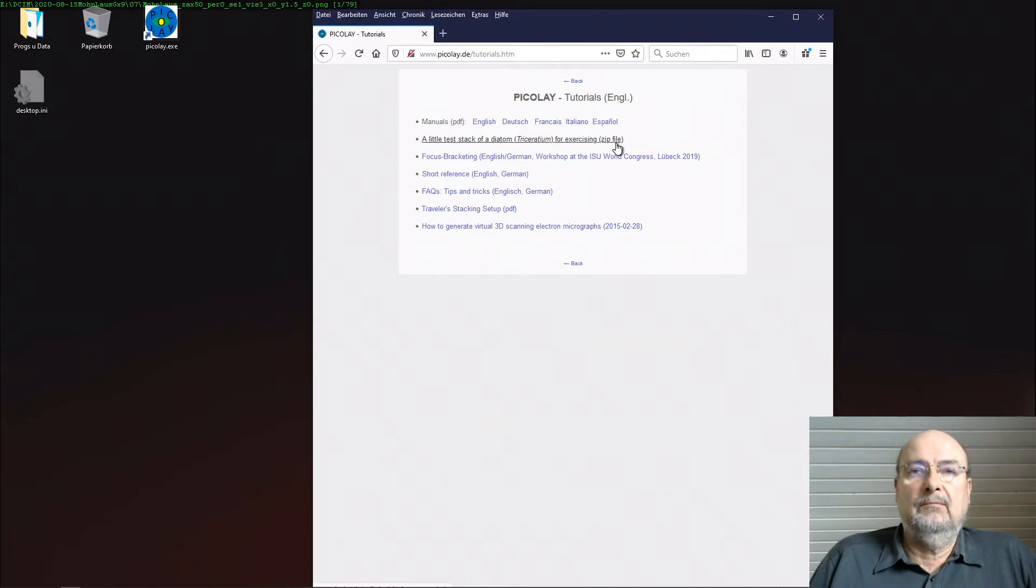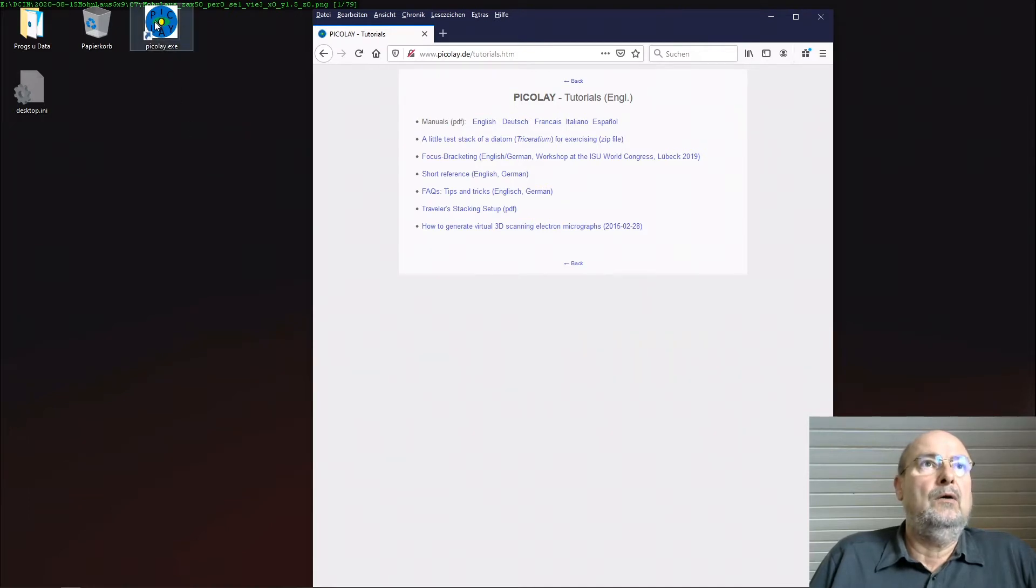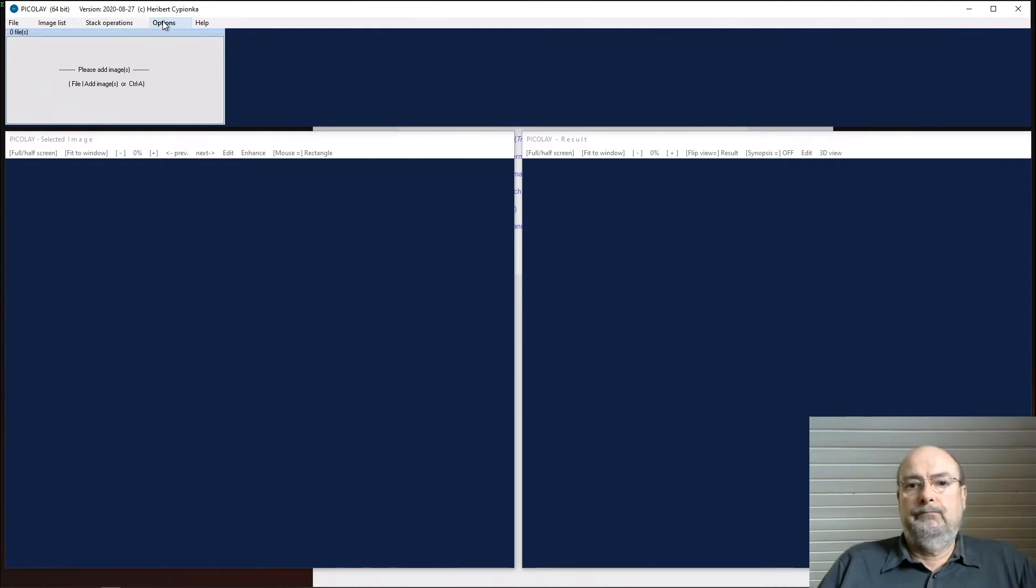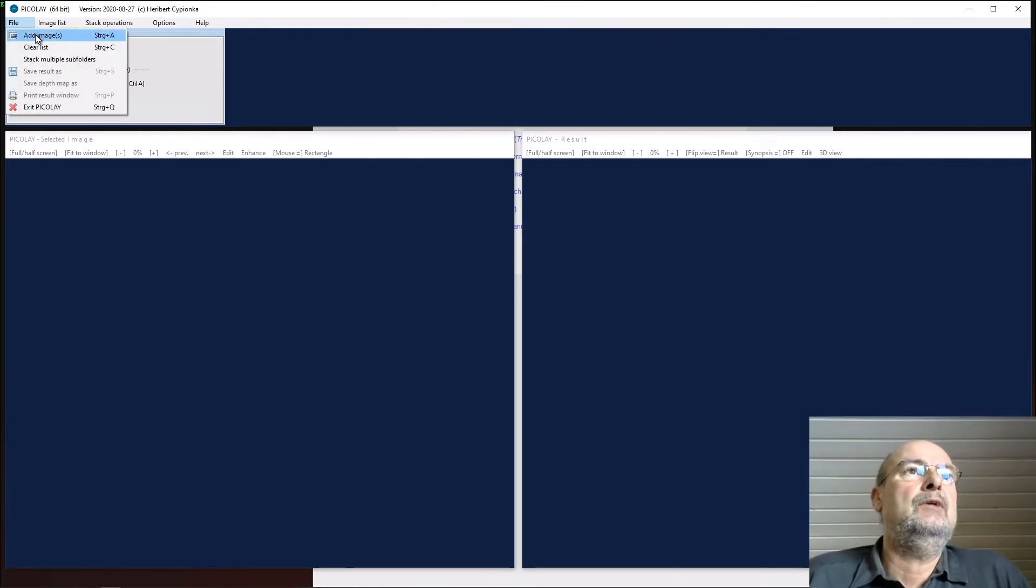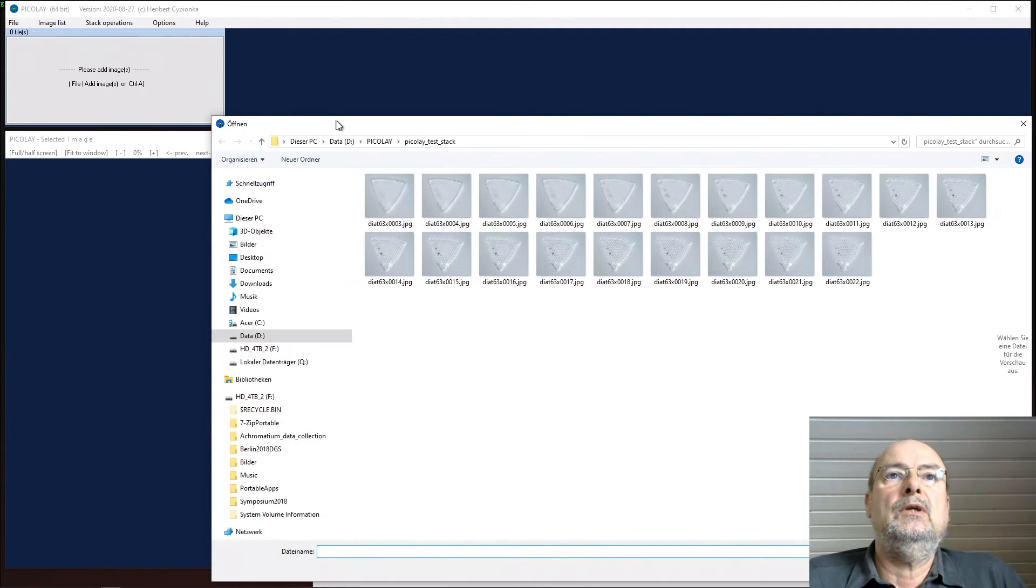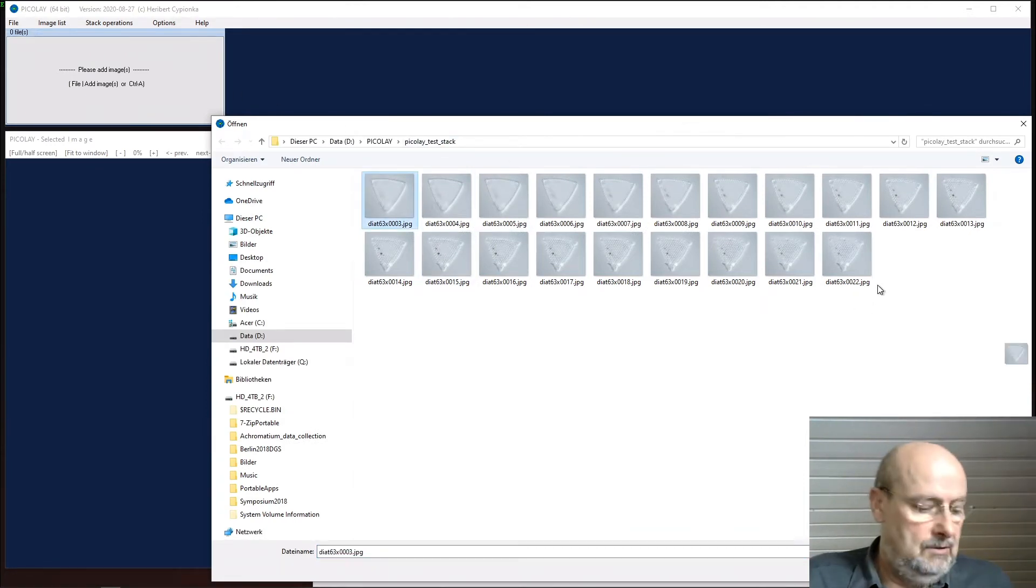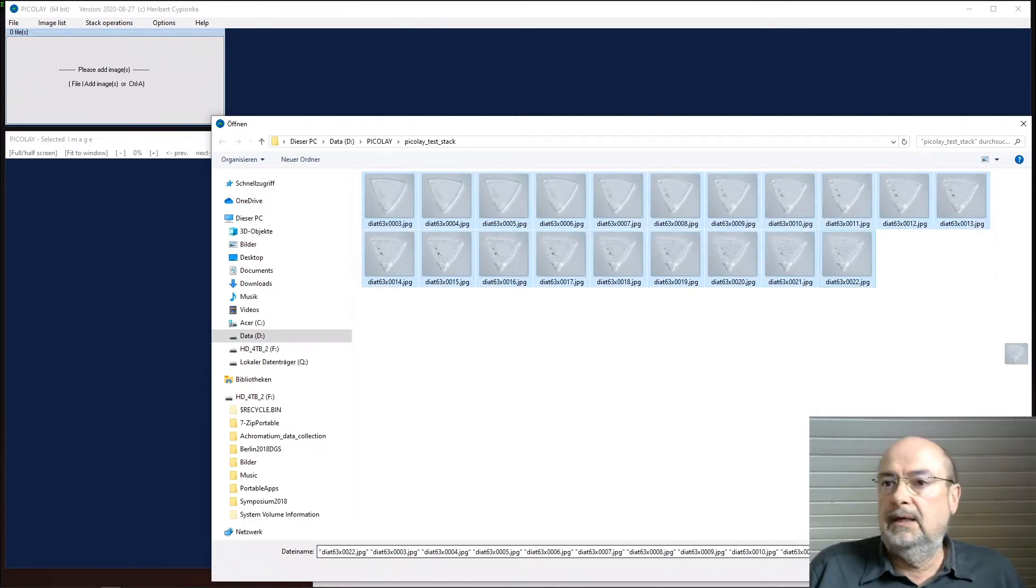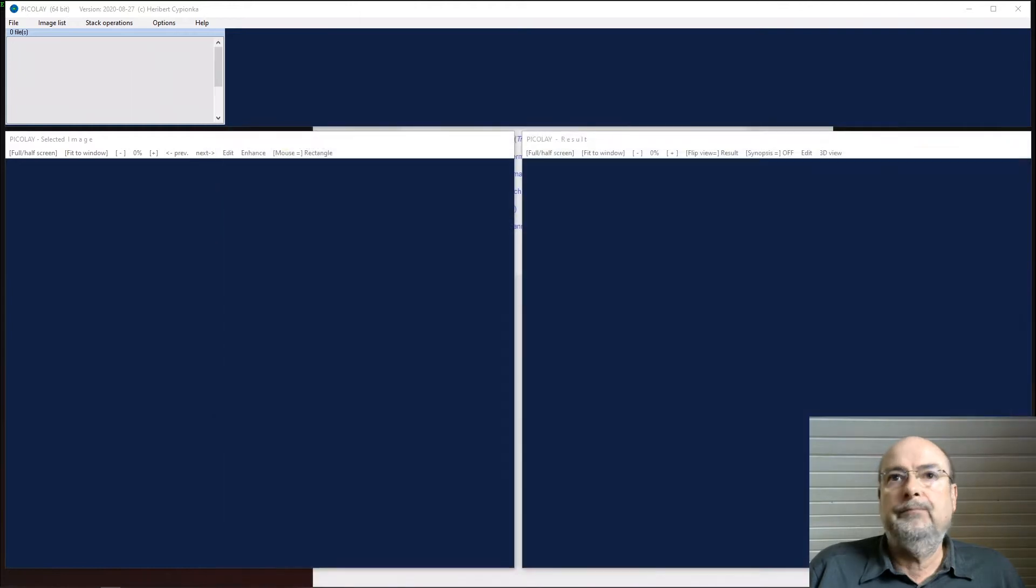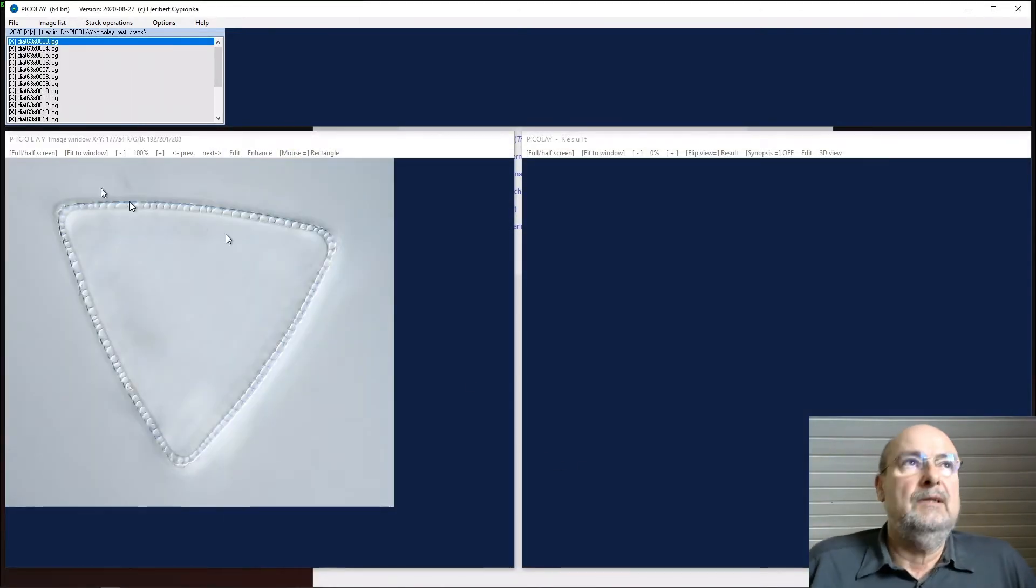That's it, and let's look how it goes. I'm starting Picolet. I load the images, add images, here's the Picolet test stack. I click on the first image, hold shift key and the last one - could also press Ctrl-A - and I open the images.